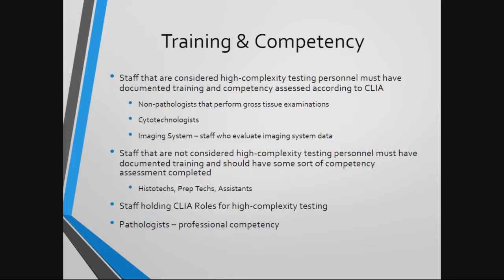While histotechs, your prep techs, and any assistants are not considered high complexity testing personnel, and they're not required to abide by those same competency standards as those that are, you should still be able to demonstrate competency for all lab staff as well as evidence of training.